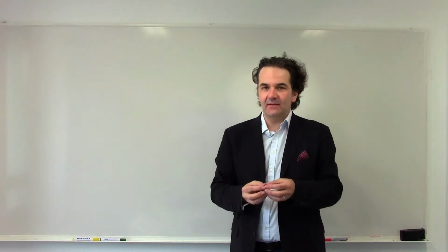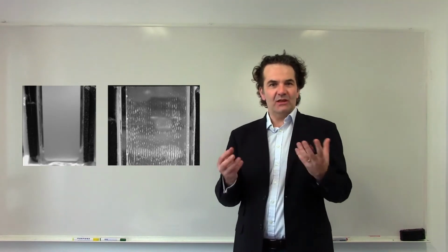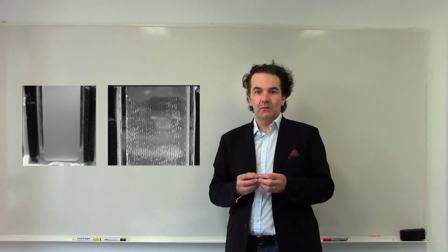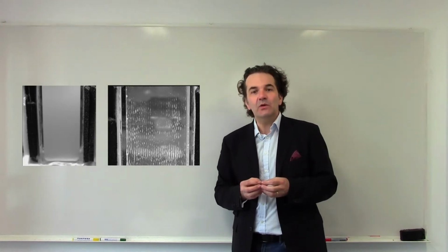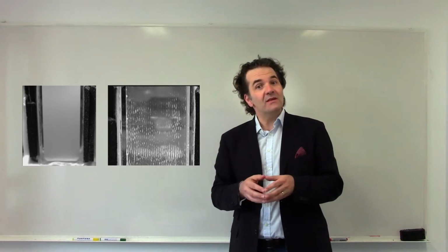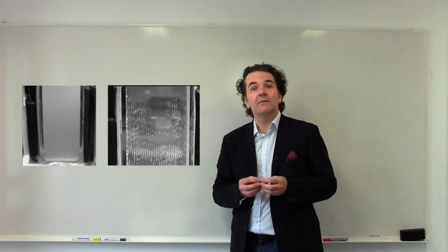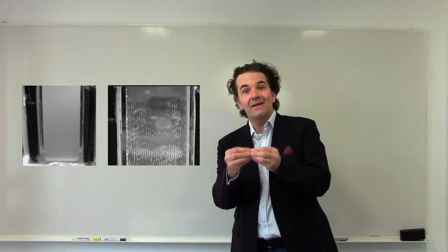Now what I mean by that, you see in those pictures, on the left hand side you see particles evenly distributed in a volume. What you see is a whitish, grayish distribution. If we switch on the sound, it orders the particles in the so-called nodal planes, the pressure nodal planes in this case, and you see in between the clear liquid. So now if you point an instrument on those agglomerates, you will see an increase of particle material. If you look between those planes, then the signal comes mainly from the liquid. And in this way you can distinguish between signal from liquid and particles in line.